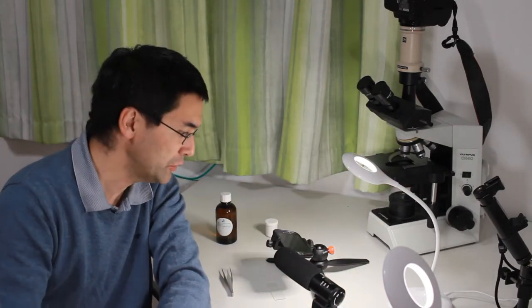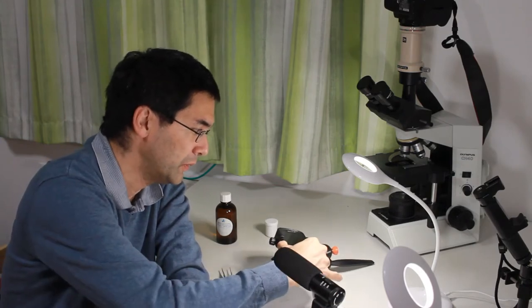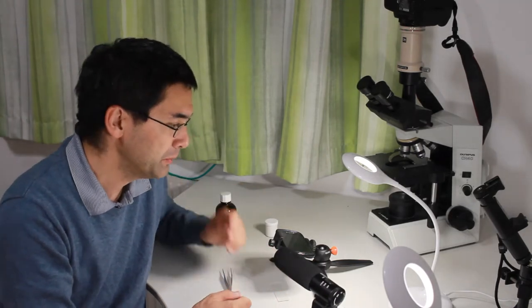And then what I'm doing generally is I'm simply preparing the slide directly on the table in front of me, with the camera on a small tripod above it, but in such a way that it does not disturb me when I'm working. I have to make sure that the shadows of my hand are not on the slide. Then I'm pressing record and recording whatever I'm doing, and then I download the video and edit it. I'm not editing the program, I'm editing the video file in my software, okay?